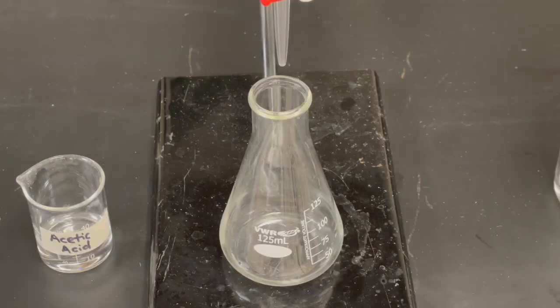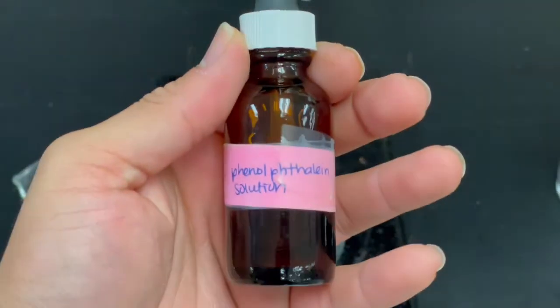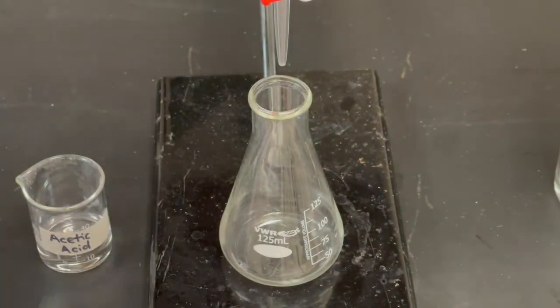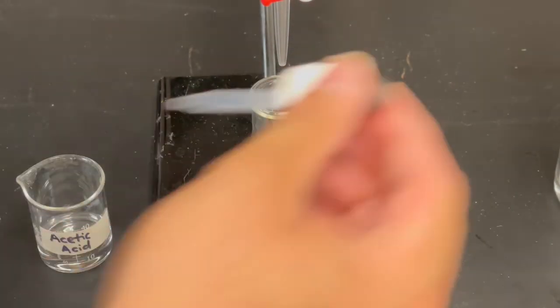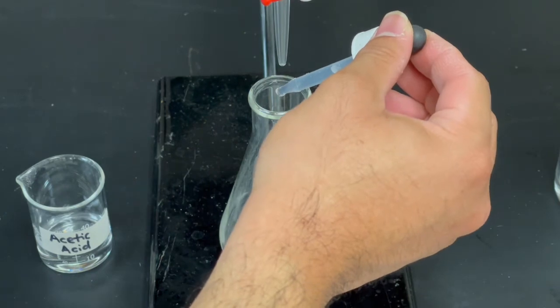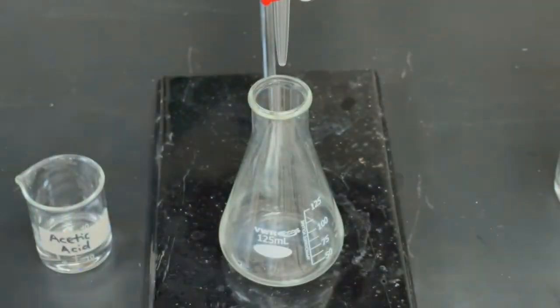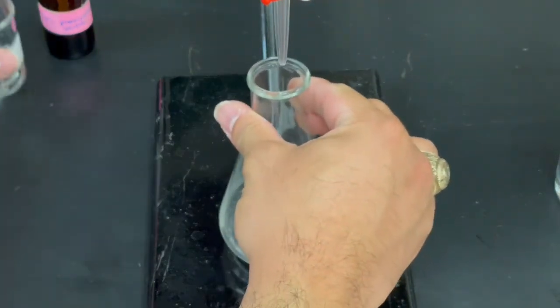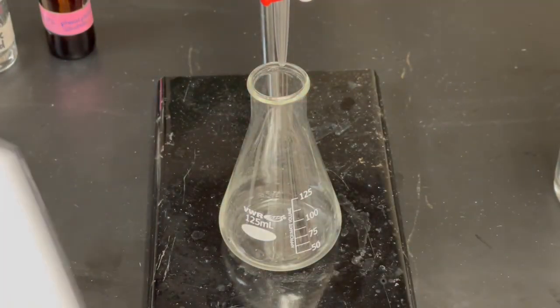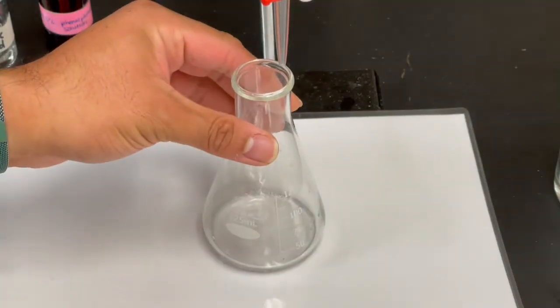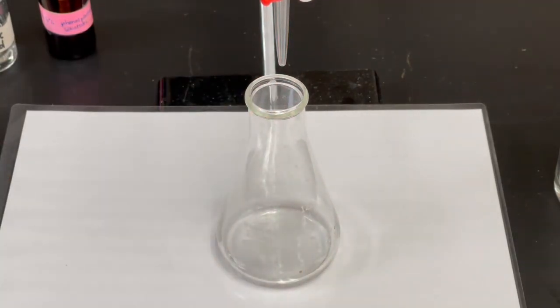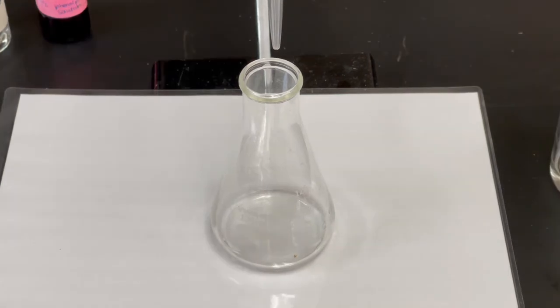The next step is to add two to three drops of phenolphthalein into my Erlenmeyer flask. One, two, three. Shake it. And then I'm going to be placing a white sheet underneath to detect any color change. Let's move on to our next step.